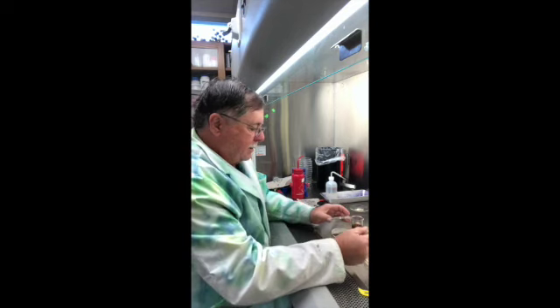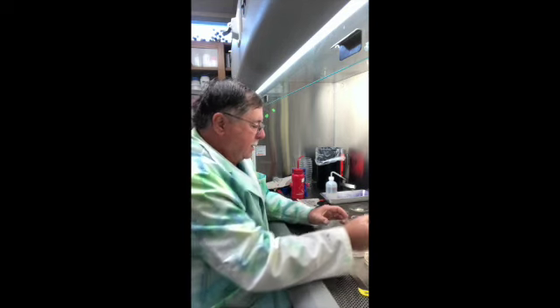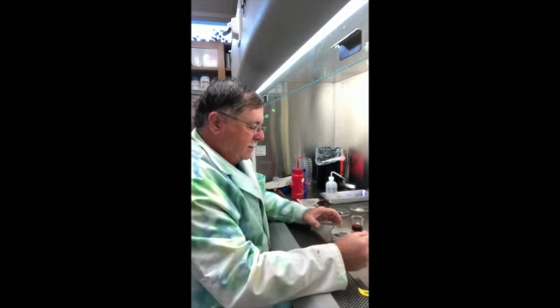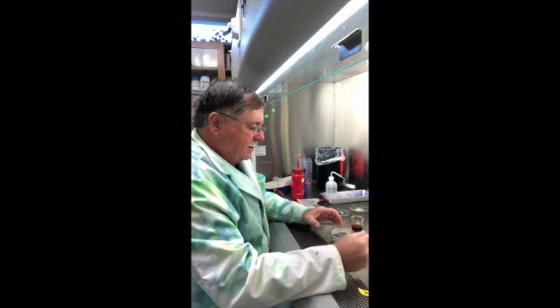I'm going to do this to all of the plates. I don't have to flood everything, just the colonies or the cells.